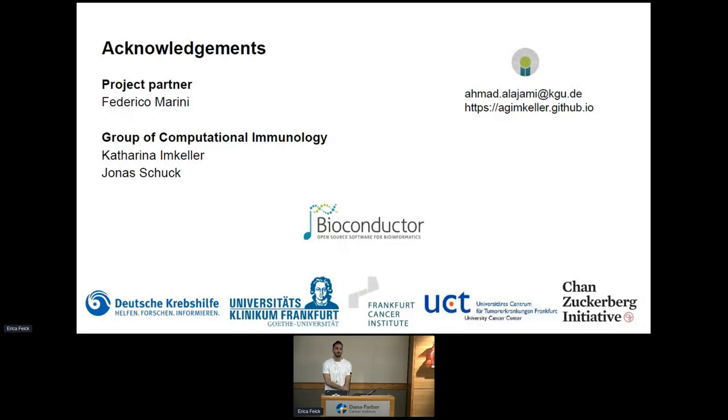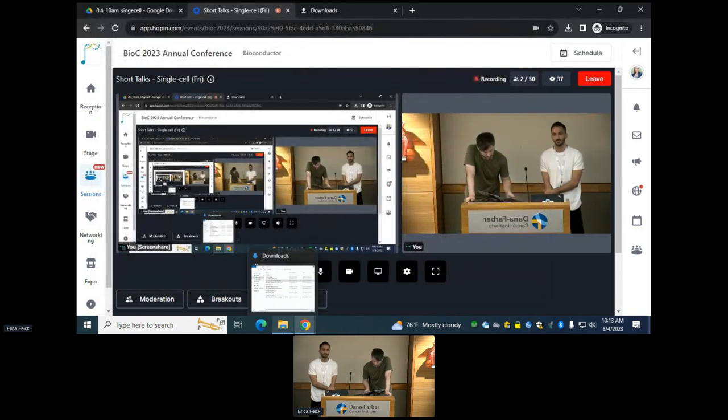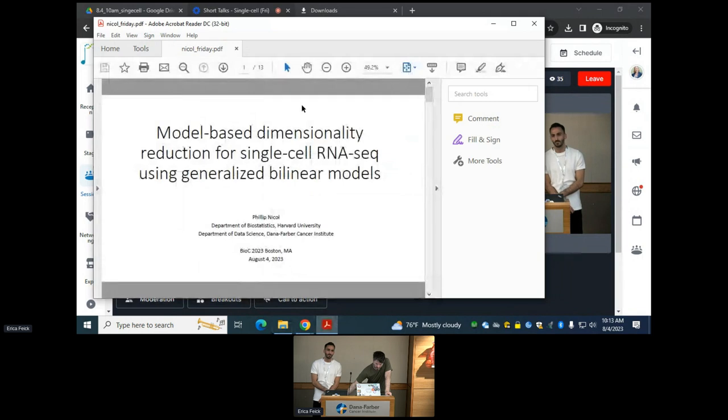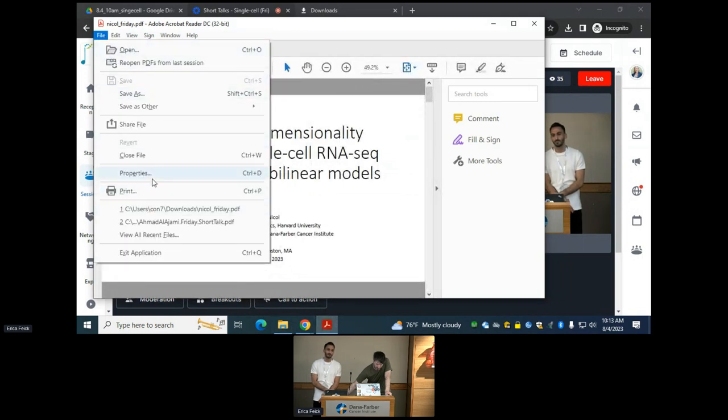One more follow-up. You mentioned reference-free methods for quantification, which seemed like a terrific idea, especially when focusing on, say, HLA and KIR. How does that work out in terms of managing the combinatorial explosion of alleles that can be seen across groups of genes when you're visualizing them? I assume that you were using something like iSEE for the allelic visualization. Are there any problems that arise when doing that, or is it a non-issue in practice?